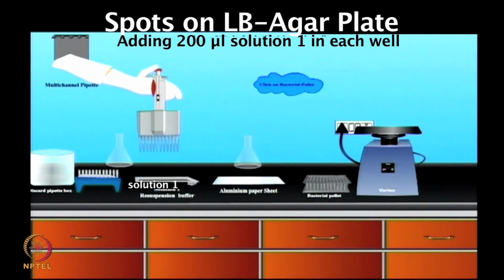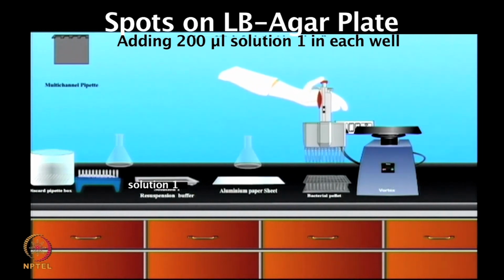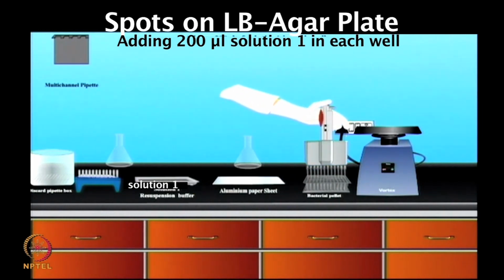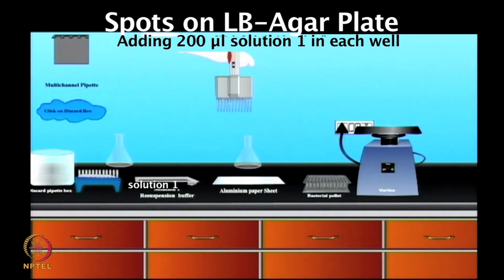Remember, in the last step we made the bacterial pellet from those culture blocks, and now you can add this 200 microliters of resuspension buffer in each well.